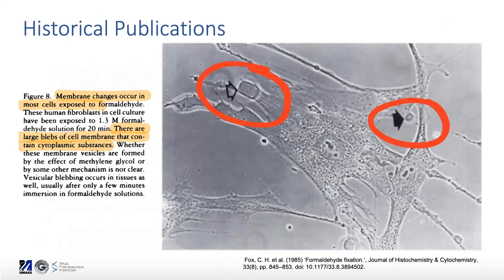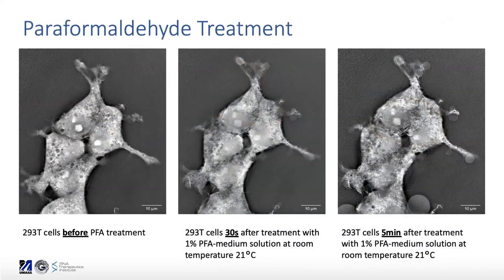Using today's techniques, here is the typical experiment I was doing — taking images of cells before and after the fixation process. Even after 30 seconds following treatment with paraformaldehyde you can see blebs coming up, especially on the top of the image. In the third image on the far right, after five minutes, they are much larger and much easier to identify.